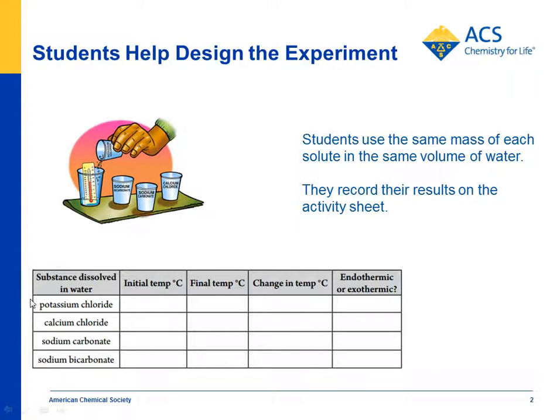For these substances, potassium chloride and sodium bicarbonate are endothermic — the temperature will go down as they dissolve. Calcium chloride and sodium carbonate are exothermic — the temperature will go up as they dissolve.